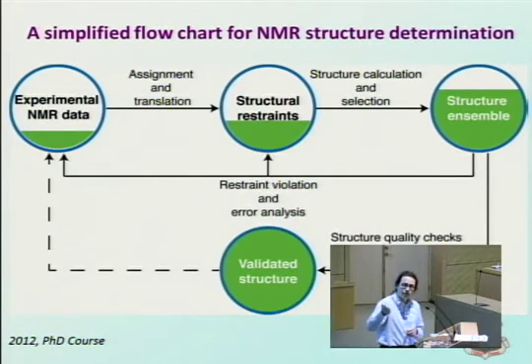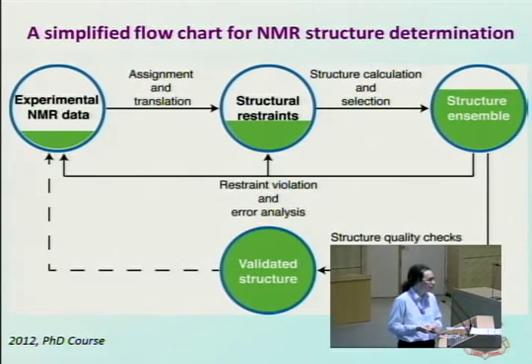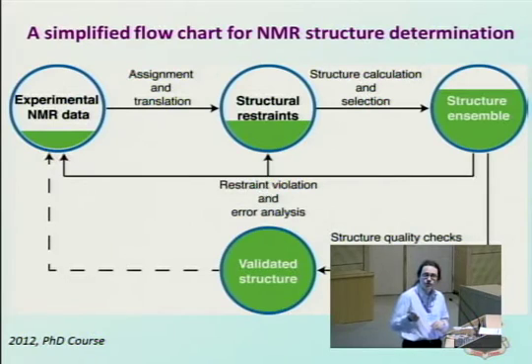And we also have something that addresses the assignment of cross peaks, but there's no time to demonstrate that today. And that goes actually into the CASD-NMR initiative that Alexander mentioned yesterday, and I have a couple of slides also for that.